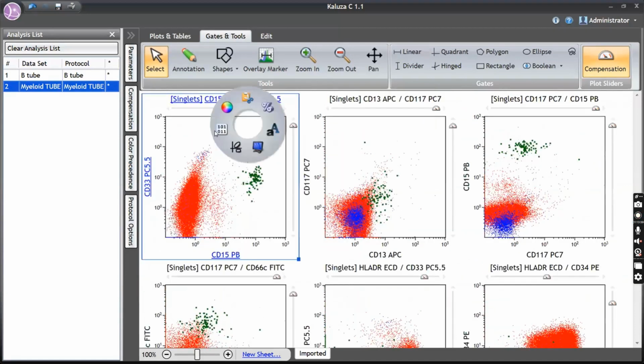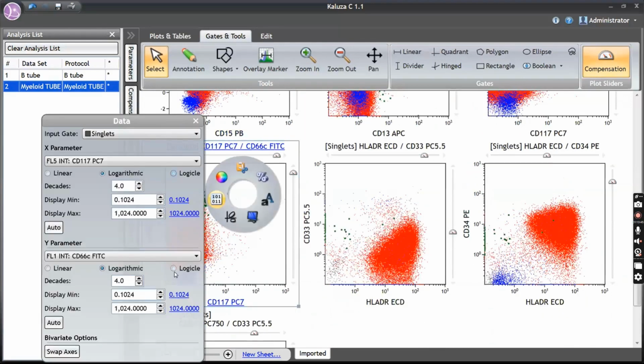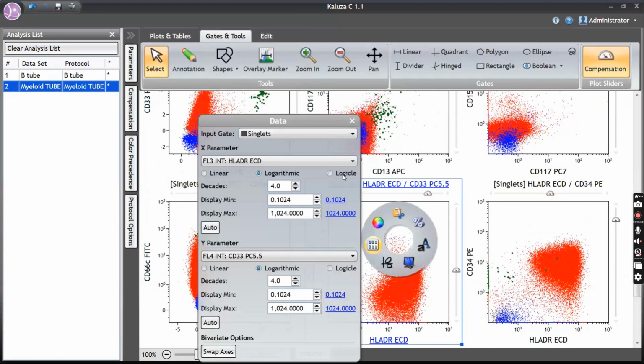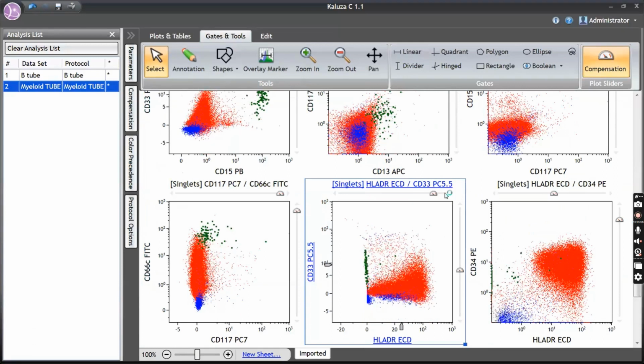What else? 15 is negative. Okay, if you have a difference of opinion, let's stop me there. So that's negative. What else marker do I have to say? HLA-DR positive, correct? What would be your internal positive control for HLA-DR? Positive internal control for HLA-DR?